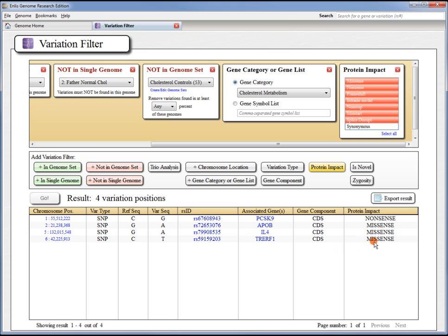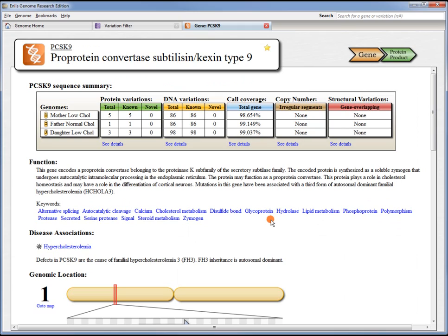We found three missense variations and one nonsense variation. This nonsense variation is pretty interesting. It's in this gene called PCSK9. If we're unfamiliar with this gene, we can click on the link here to open up a gene page. On the gene page, we've accumulated everything we know about this gene for all the genomes that we have loaded.